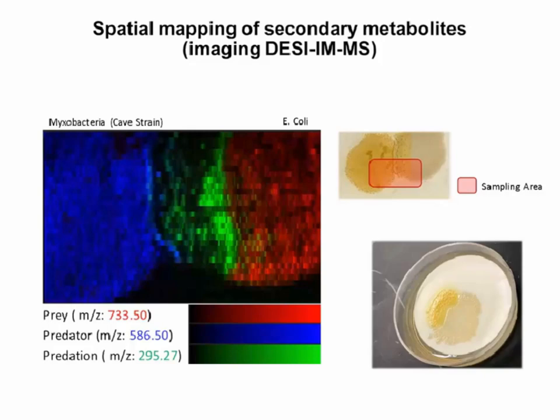Not only are the microbes unperturbed during the sampling, but they're also prepared in less than about 10 minutes. So this method offers a holistic analysis of the environment of the microbes. Cells are grown on the membranes on top of the agar and the growth media. And the membrane serves to allow nutrients to pass through to the microbes, but it retains the colonies on its surface.